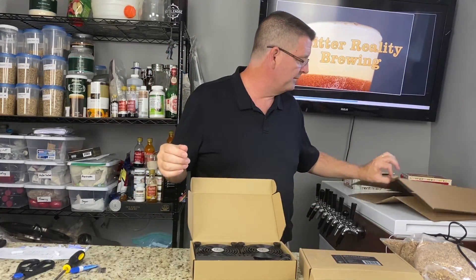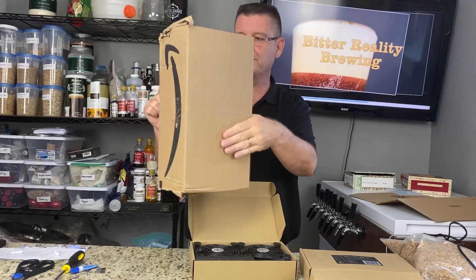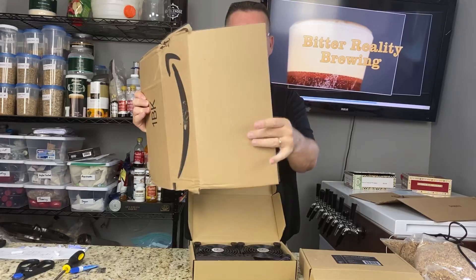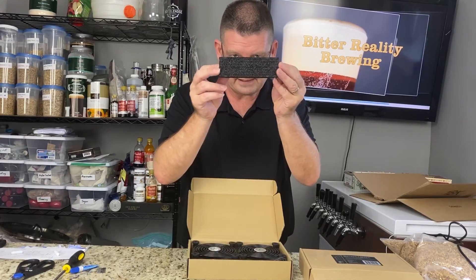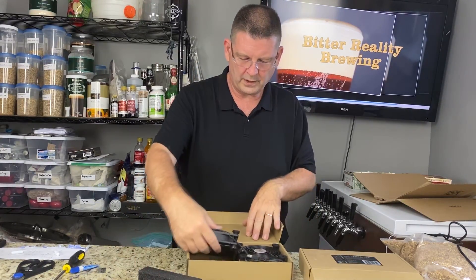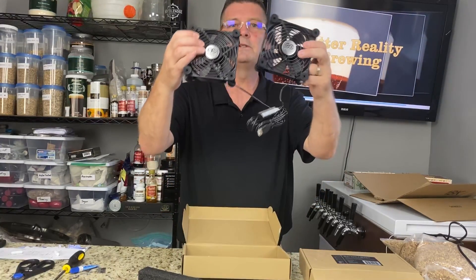What you will need is some cardboard from your Amazon orders. Make sure you get the good cardboard, not something that's already torn up and bent. We're going to take these fans and we'll need the foam packaging — we're going to throw it away, but we're going to need it momentarily.